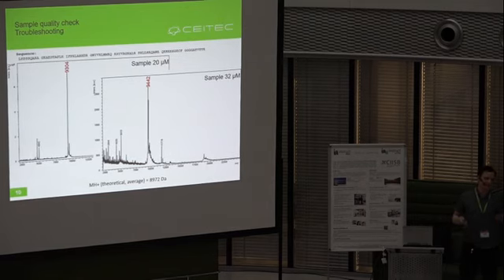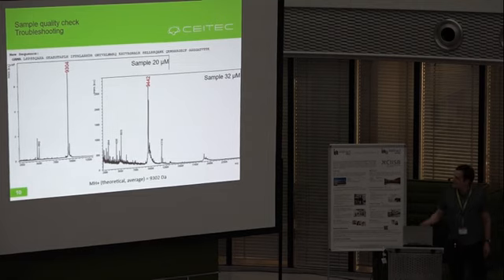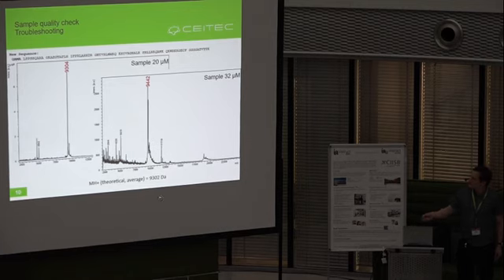So we asked the customer in the following email which 2 amino acids were added to the protein. The result was surprising. There were not 2, there were 4 other amino acids. And now the theoretical mass nicely matches one of the samples. But what could happen to the second one?